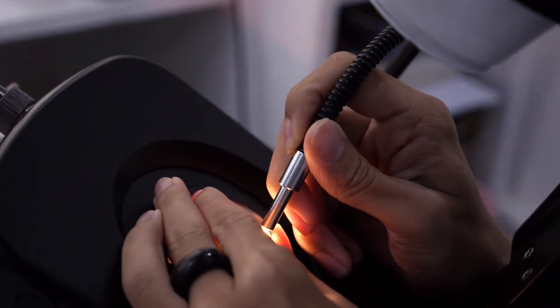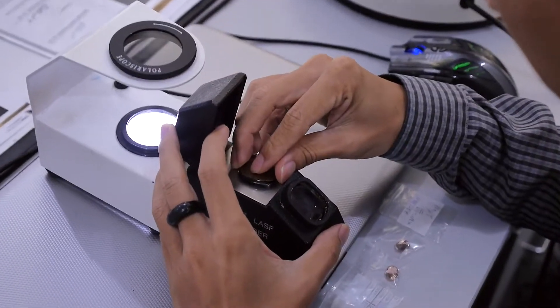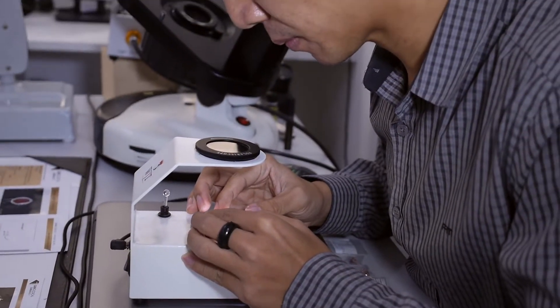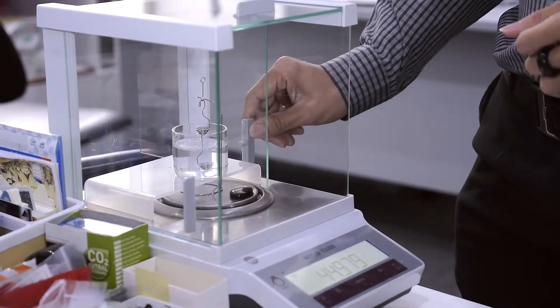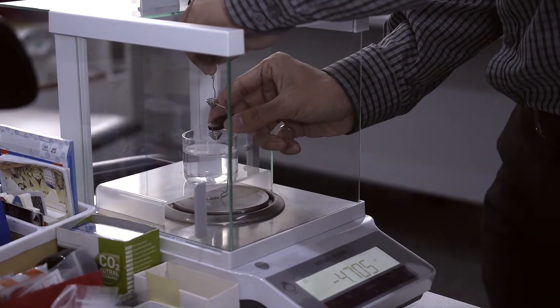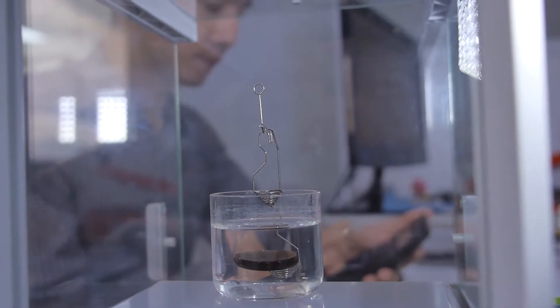Okay so we have the standard gemological tools. We're going to check according to the fastest way. Such as we have the microscope, refractometer, polariscope, the SG machine for checking specific gravity, and of course the spectroscope as well.